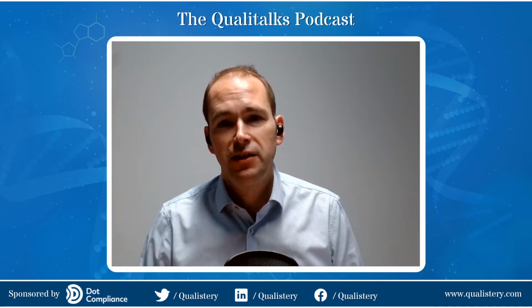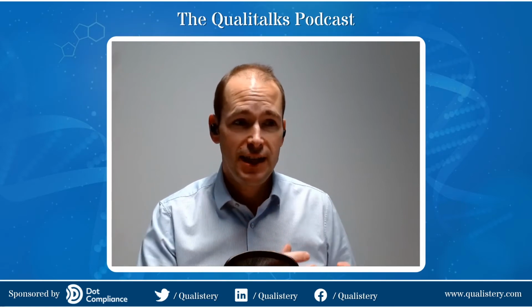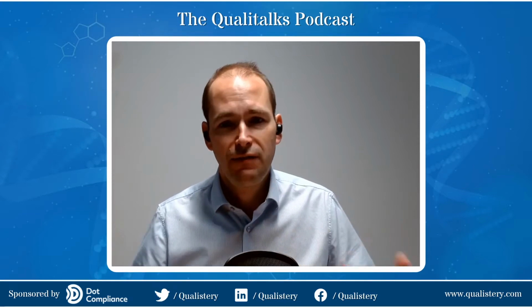So what are the major types of autoclaves that we see on the market right now? Well, there's really two main types. So we've got a fluids load autoclave, and that's used for terminal sterilization of things like syringes and bottles and final products. So they're sealed containers with an aqueous solution inside, so a liquid water-based solution. And essentially, it's generating its own steam inside that container. And then the other main type of an autoclave is a porous load sterilizer. And essentially, that's items that are being placed within the autoclave and we're sterilizing the surface of them. So they might be instruments that are used during production that would come into contact with the product. So there's two main types, fluids and porous load autoclaves, and they have slightly different ways of setting them up to make sure that it's suitable to your process.